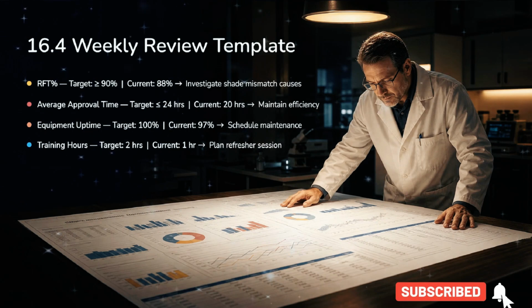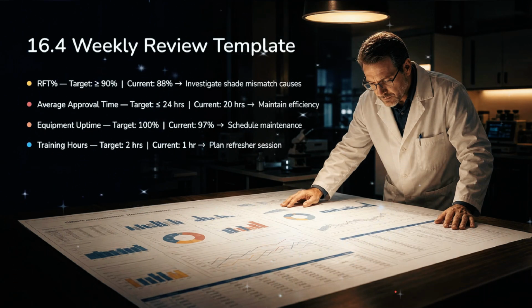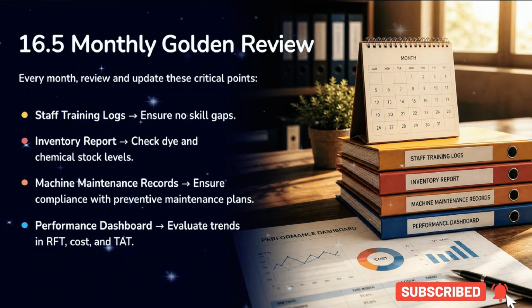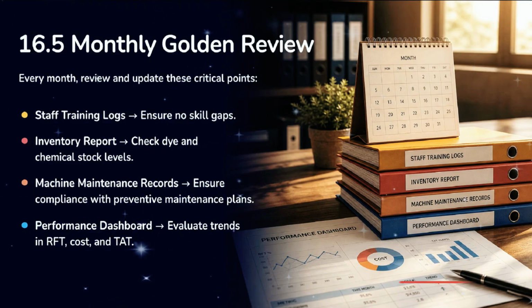Use the weekly review template to monitor your KPIs. Comparing your current performance against targets allows you to identify areas for immediate investigation or improvement. For your monthly golden review, track these critical points: staff training, inventory levels, maintenance compliance, and overall trends in performance to keep your lab on track.